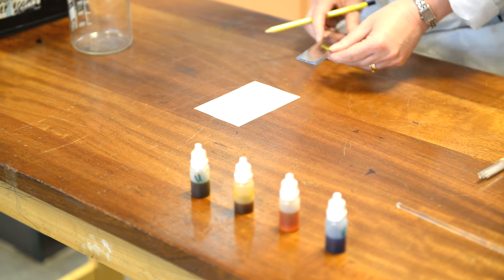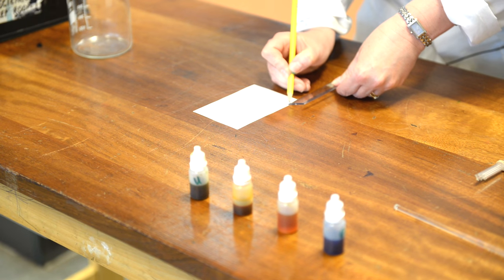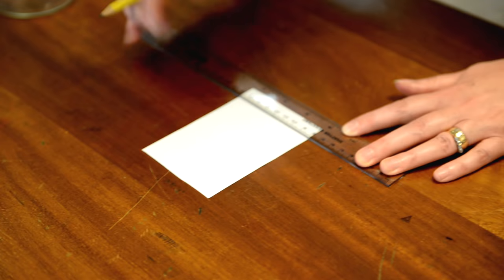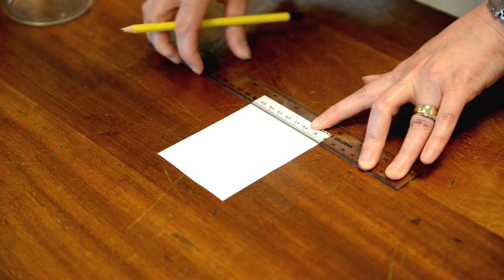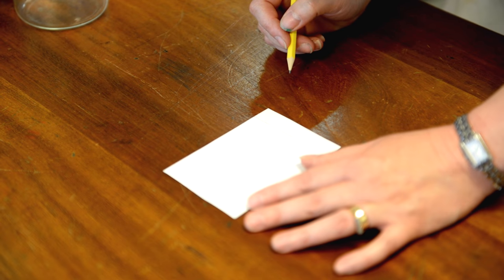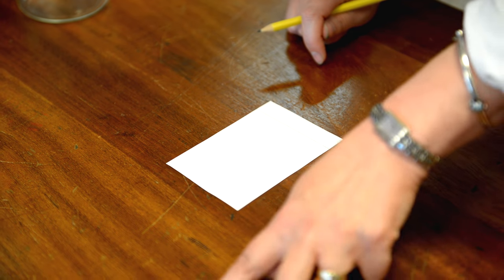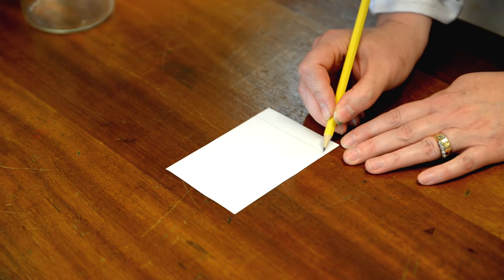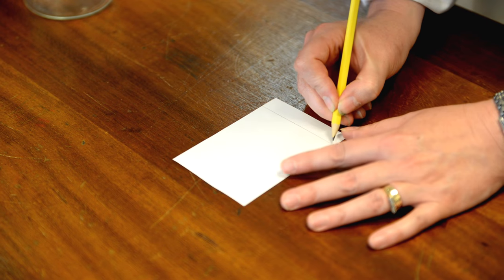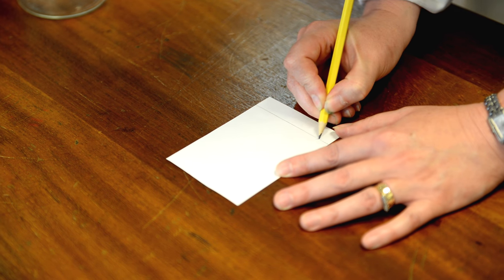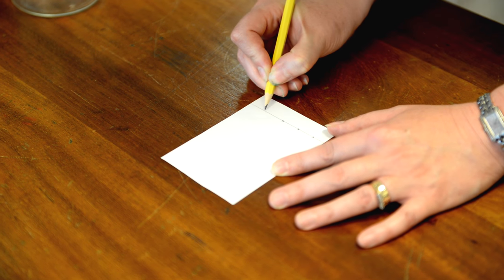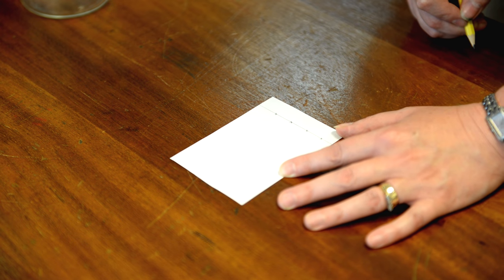So we take a ruler and roughly two centimeters from the base of the paper we draw a straight line across the bottom. Then onto that we're going to mark four points where we're going to place four food colorings. We don't want to go too close to the edge because the separation doesn't work so well near the edge. So about one centimeter in we'll put our first cross and then evenly place our other crosses going along the baseline.